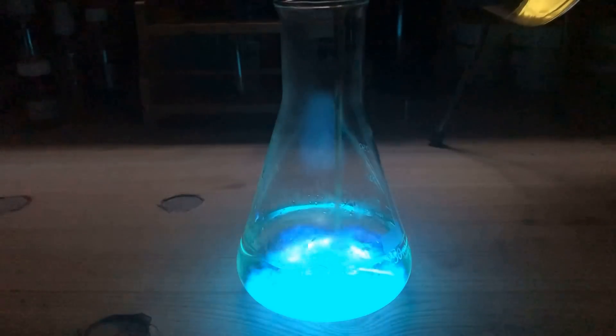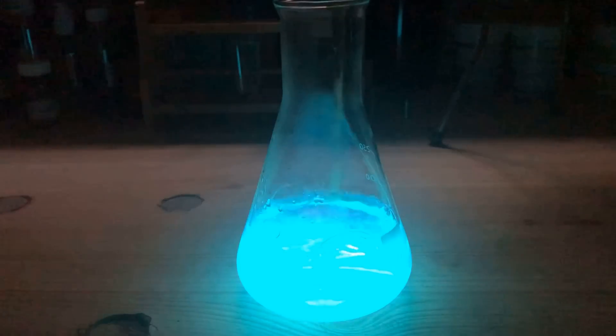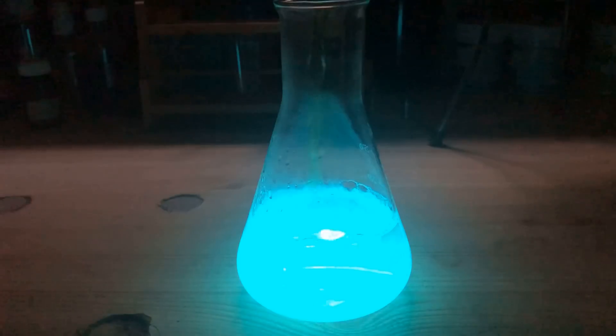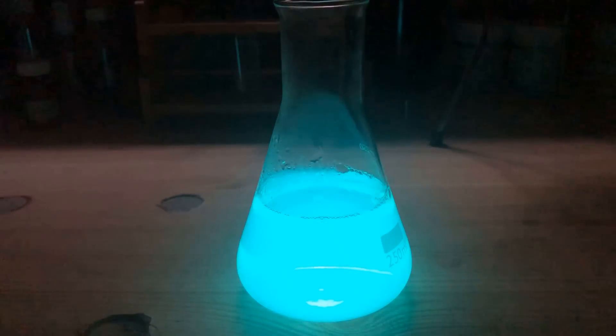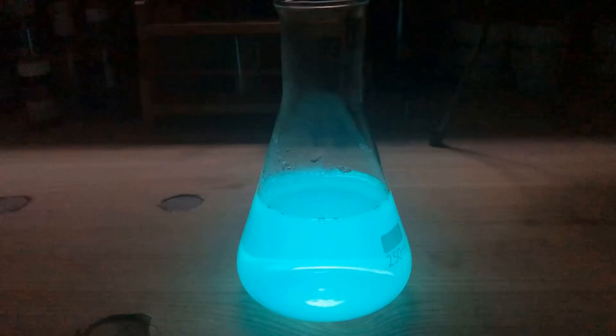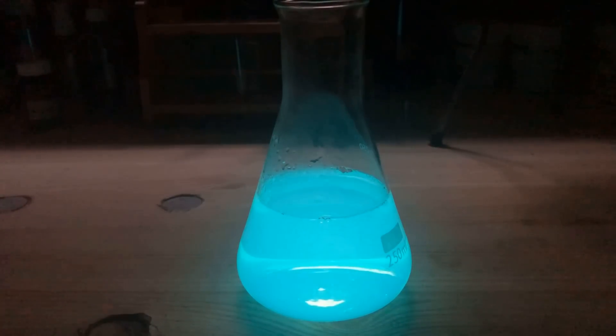When we add the potassium ferricyanide hydrogen peroxide solution to an ordinary sodium carbonate luminol solution, the chemiluminescence is very intense but soon fades. Anyway, at least the luminol-based artificial luminous fish don't seem to be suitable as a nightlight substitute.